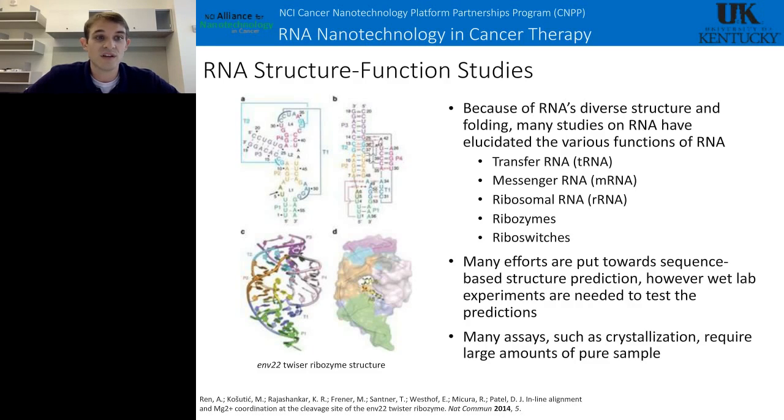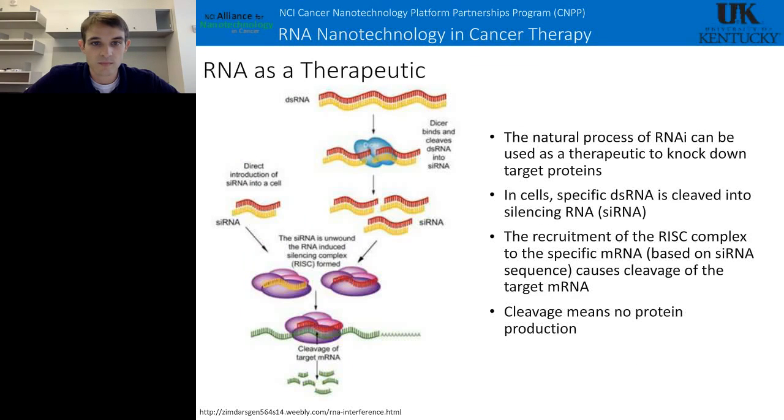And a lot of this is done by assays such as NMR or crystallization. And techniques like this require huge amounts of RNA, milligram amounts, which may not sound like huge amounts, but for RNA, it's quite a bit. So because of that, we definitely need enhanced ways to create large amounts of RNA so that we can enhance the field of RNA research. So like I said earlier, RNA can also be used as a therapeutic.